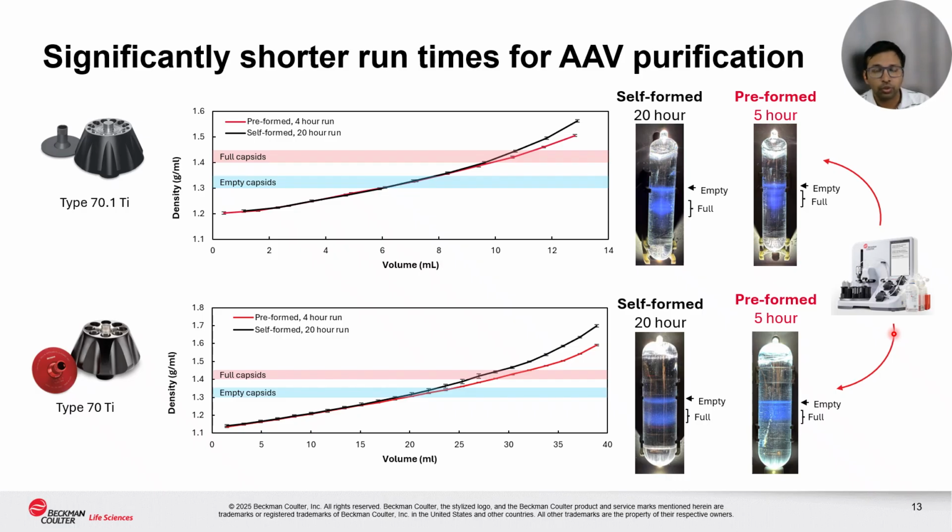So one question is: is this semi-purification, or are these partially filled capsids? I'll show you some data in a couple of slides that they're actually a different stoichiometry of full capsids that we're able to resolve because of the decreased steepness, and therefore better resolving power, that the preformed gradient run for a shorter time offers.